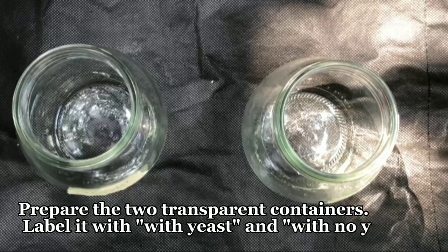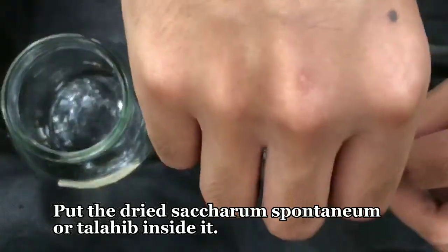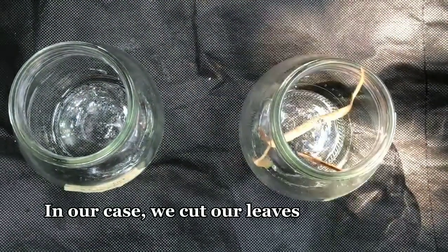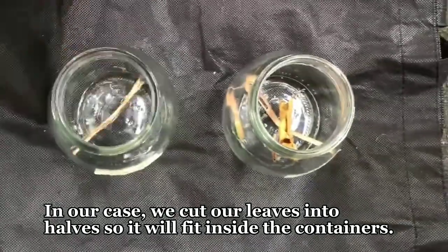Prepare the two transparent containers. Label them with 'with yeast' and 'with no yeast.' Put the dried saccharum spontaneum or talahib inside. In our case, we cut our leaves into halves so they will fit inside the containers.